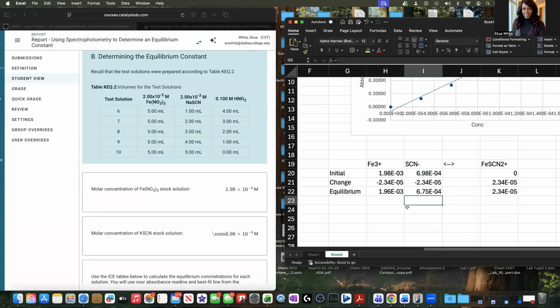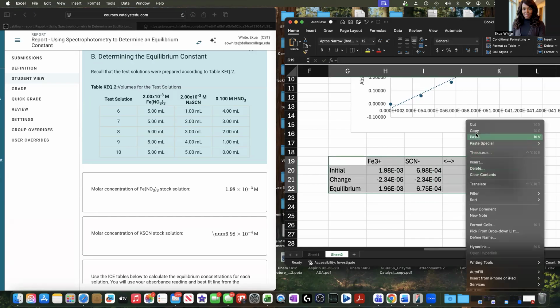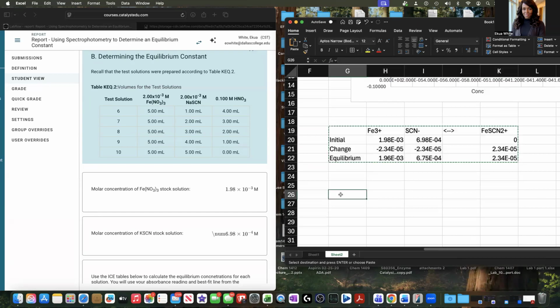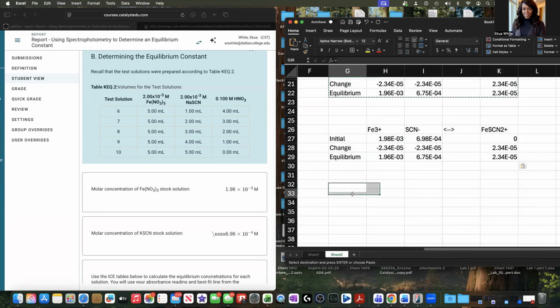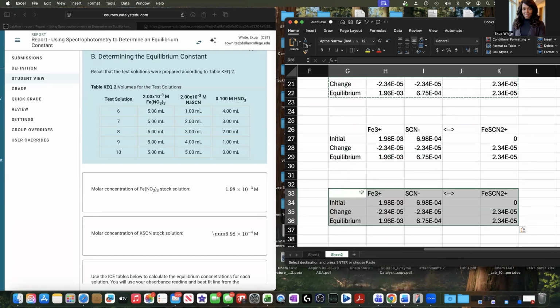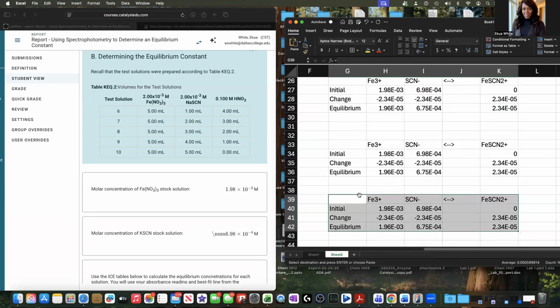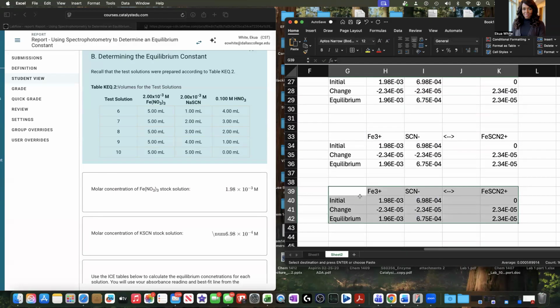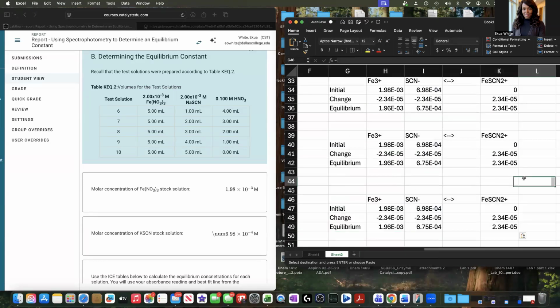Okay. So instead of me working so hard to recreate this 4 more times, who has time for all that? I got people to entertain. So let's try to copy this and paste. Copy, paste, and then paste again. We're leaving space so we remember these are different experiments. Paste again. The goal here is to be smart about this. I really hope this works, y'all, because I'm making this up as I go. I'm just trying to find an efficient way.